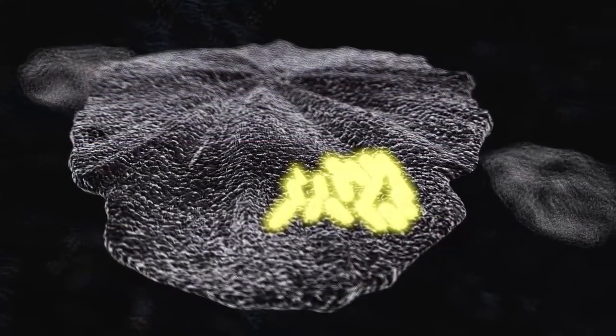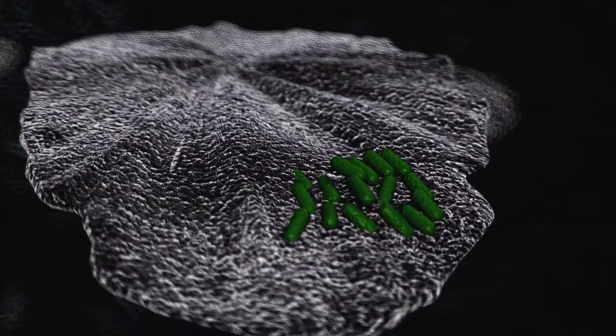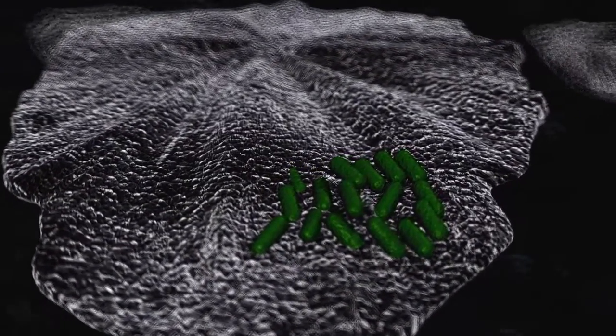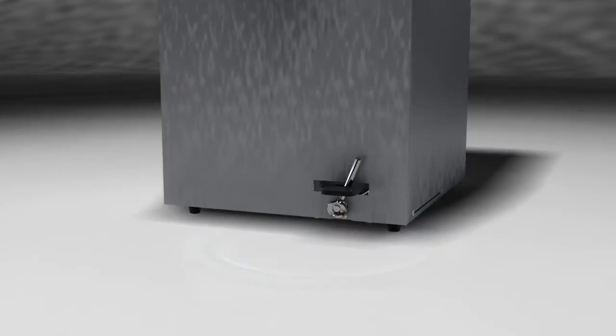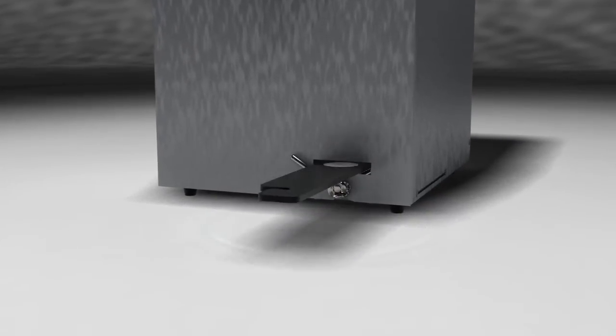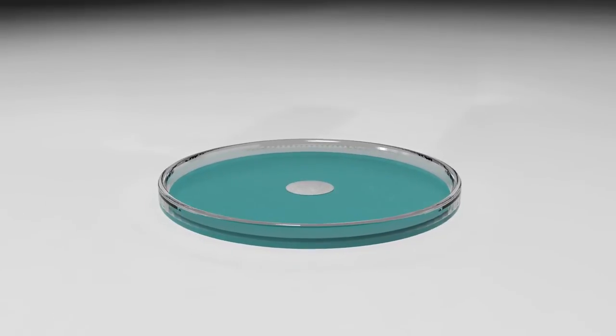During this step, cell metabolites fluoresce when excited by an ultraviolet light source, enabling the detection of airborne viable particles in real-time. Finally, there is an option to collect the optically analyzed particles on a filter to enable identification.